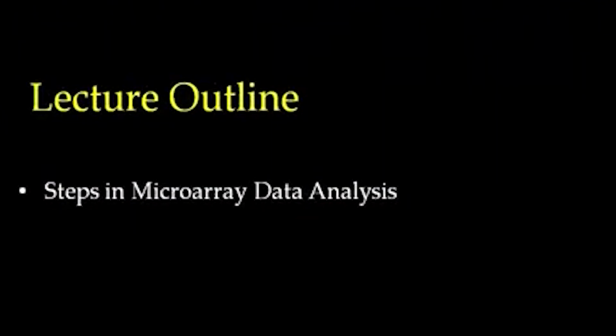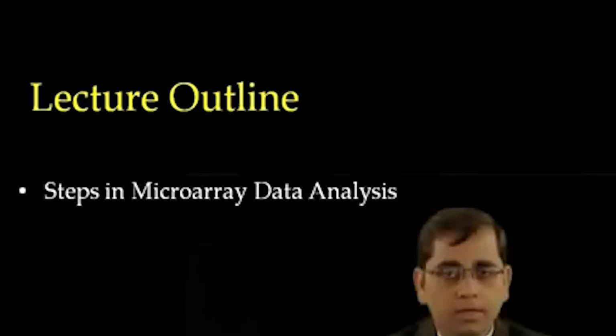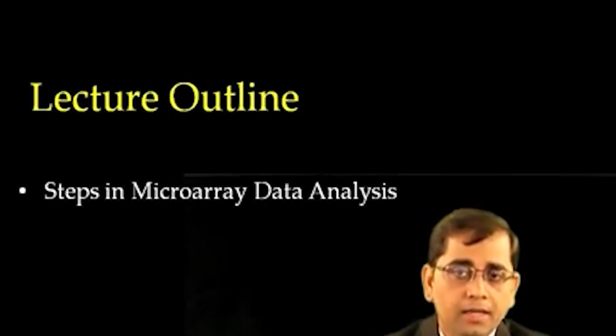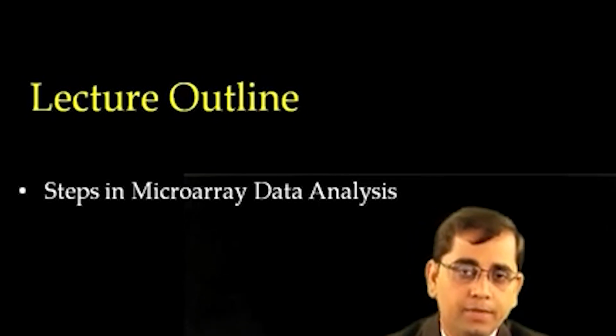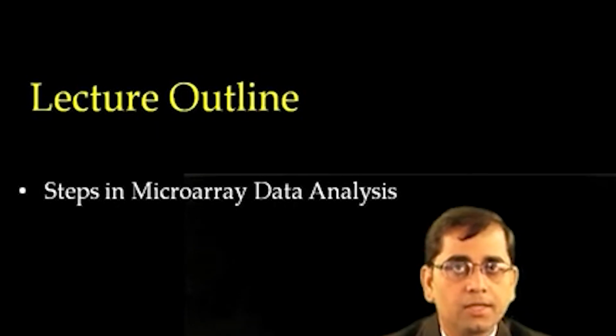In our previous lecture, we discussed the Acuity software interface and became familiar with the control parameters as well as data analysis options. In today's lecture, we will talk about data analysis and delve more into the details of all the theoretical aspects and the constraints that we have discussed over the last few lectures.